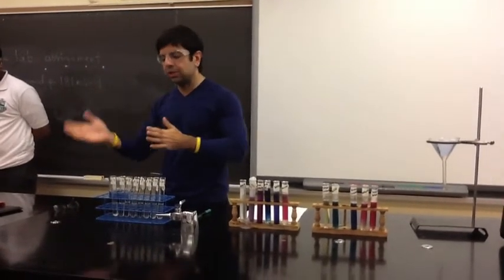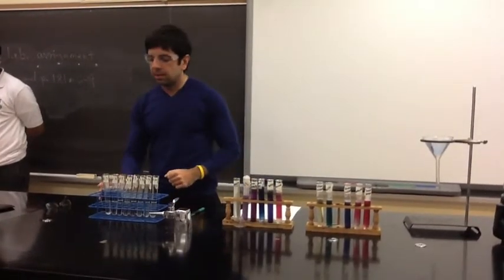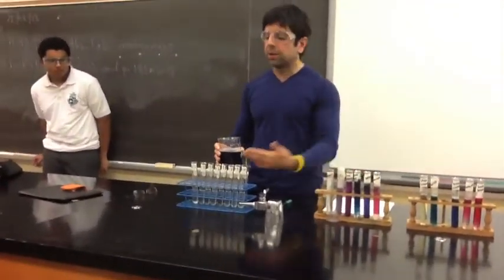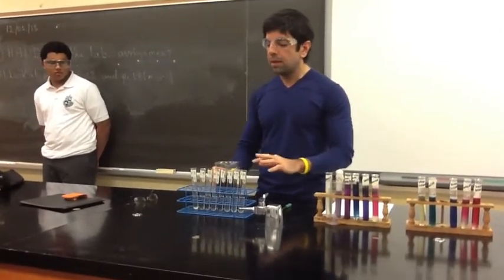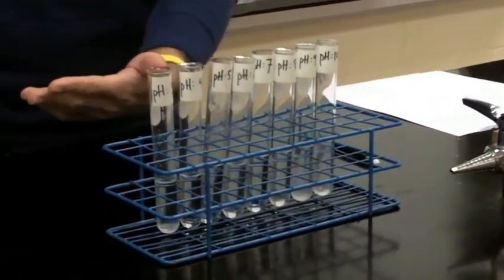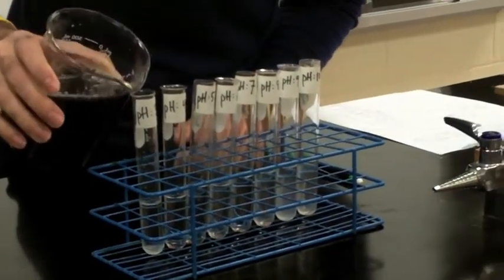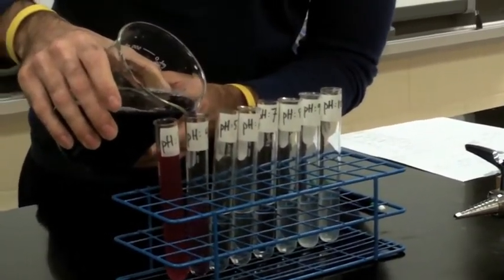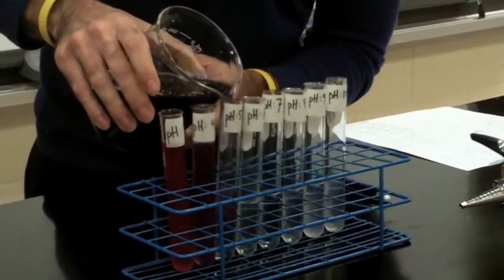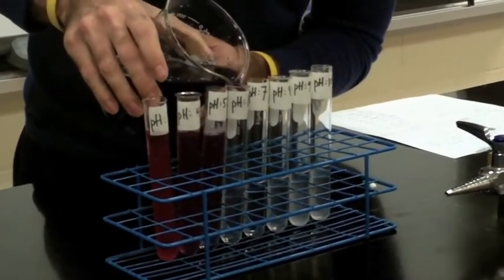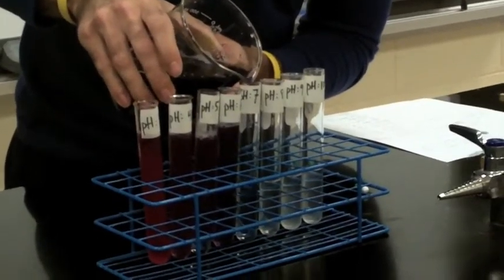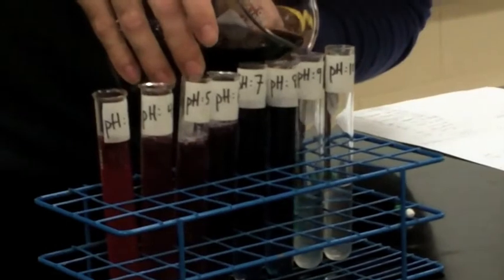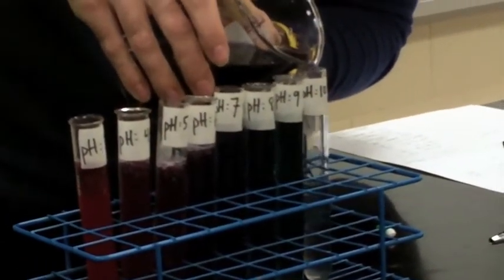I've got pH values here going from three to ten — missing pH values lower than three and higher than ten. Let's look at the color spectrum as I pour them in. Starting at pH three — acidic — and working upward: the acidity becomes less and less. Notice the color change going up to pH six, then neutral pH seven, then pH eight, pH nine, and pH ten.